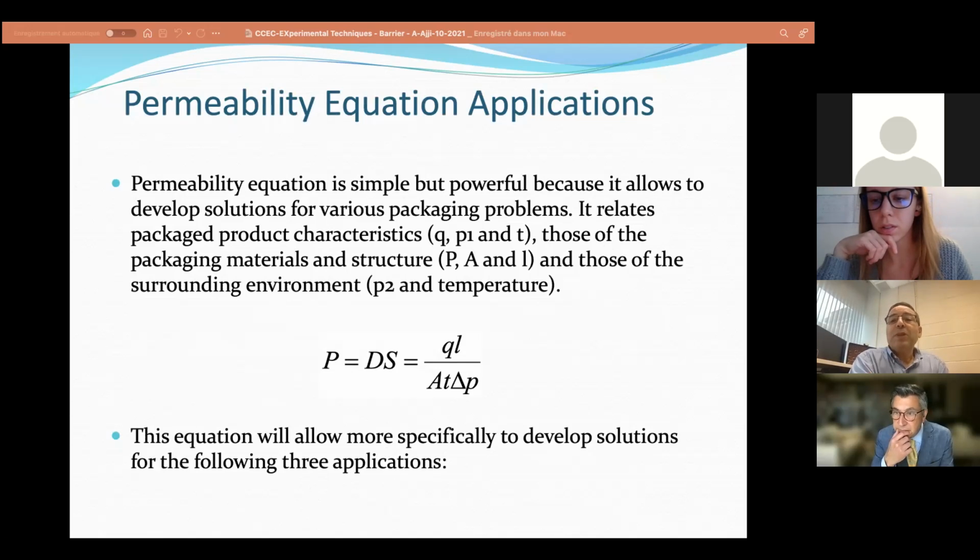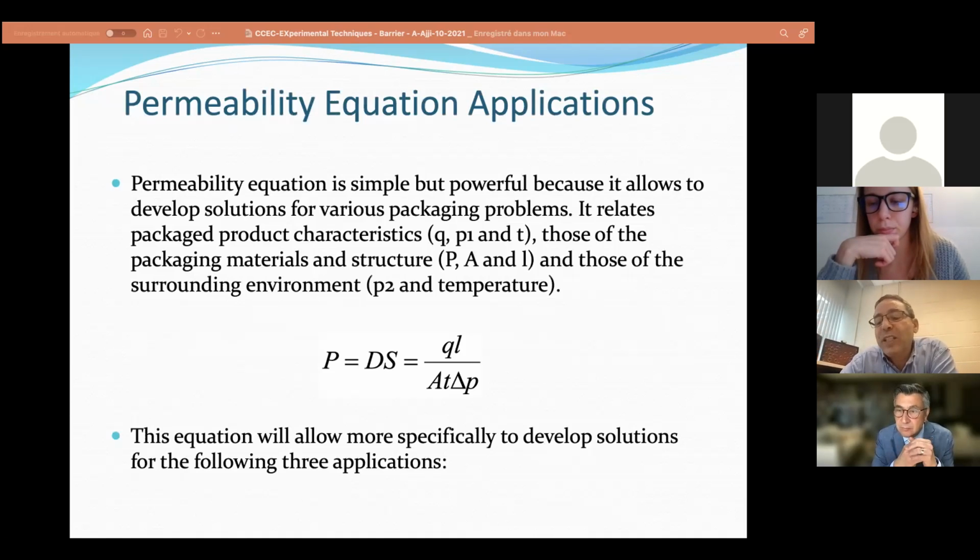Well, to be frank, because these are equipment that are sold by companies, and each company has its own technology. So sometimes they will disclose what type of detectors they use. Sometimes they will not disclose. They can be electrochemical detectors. I know we use, for example, we have separately some oxygen detectors that we can put in any environment and seal it and follow from outside, of course, if it is transparent, the evolution of oxygen content.